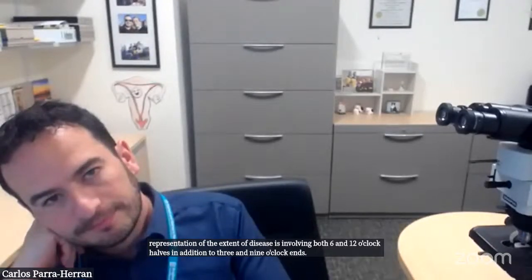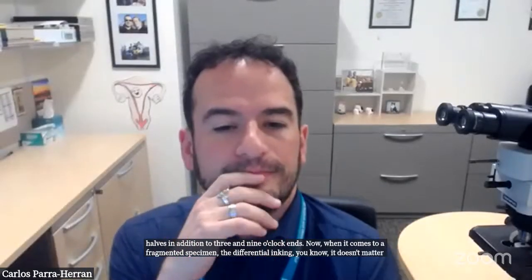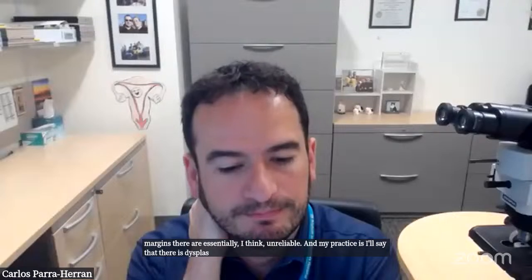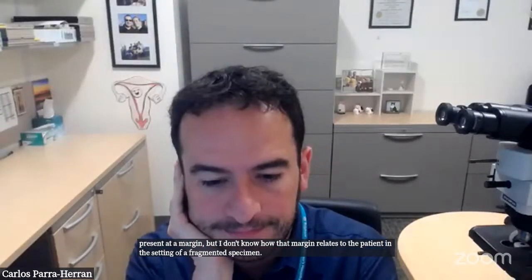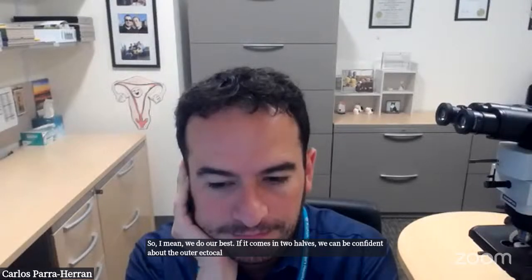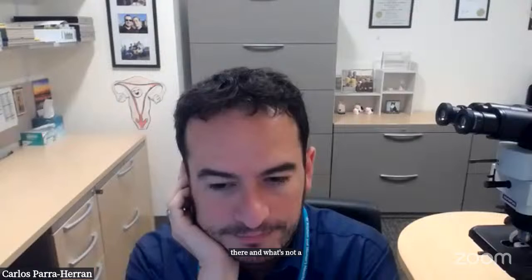Now, when it comes to a fragmented specimen, the differential inking doesn't matter. The margins there are essentially unreliable. My practice is I'll say that there is dysplasia present at a margin, but I don't know how that margin relates to the patient in the setting of a fragmented specimen. So we do our best. If it comes in 2 halves, we can be confident about the outer ectocervical, but at the points where the tissue has been disrupted, we don't know what's a true margin and what's not a real margin.